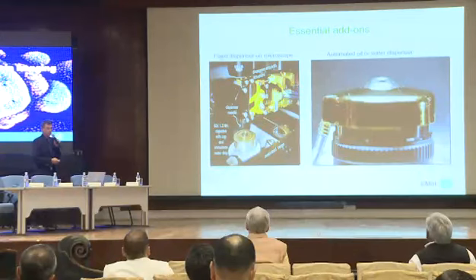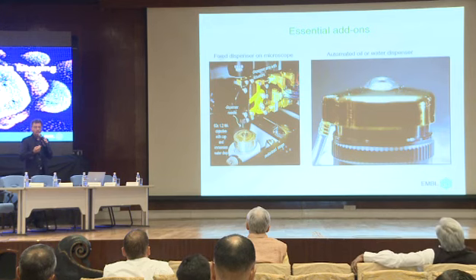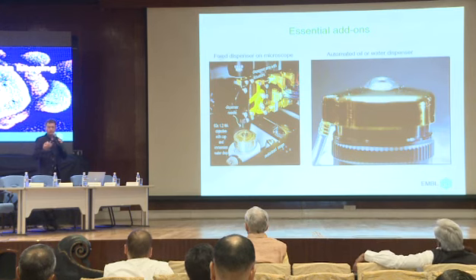In order to be able to do this, we developed with our workshops a number of essential add-ons, for example, a dispenser on the microscopes where we can exchange liquid and do the immunostaining. That's a different view of it. Very important also, because we have to do a lot of imaging, and whoever has done microscopy knows that the immersion medium, if you want to do high resolution imaging, after a while, in particular after an hour or so, is used up or gets bubbles.